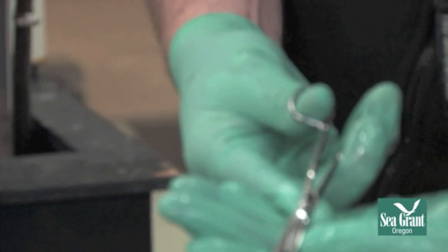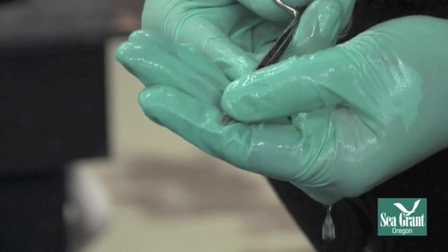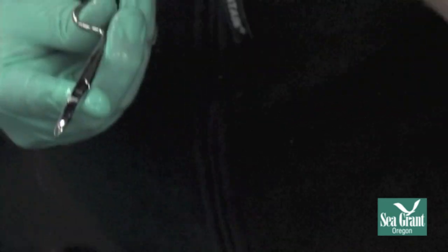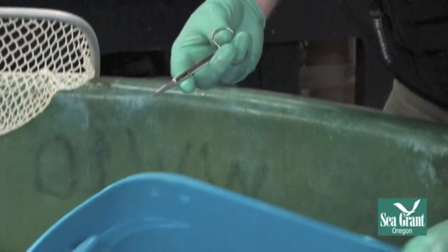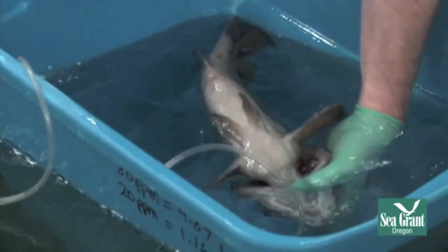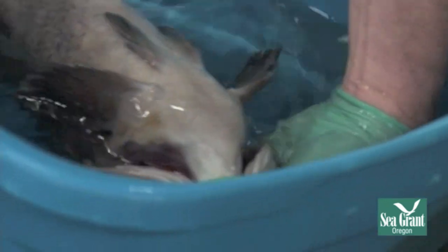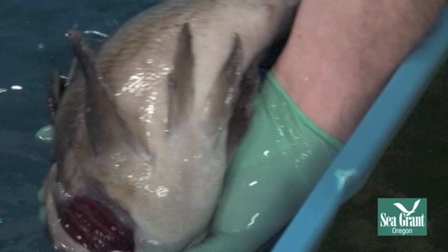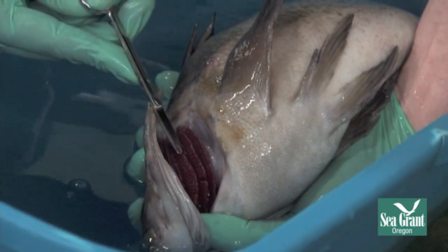What you can see is when we take our biopsy, the scissors form a little cup that holds the piece of gill right there. All we're taking is one to two millimeters. So I come in, get my fish, lift the operculum up, see the piece of gill I want to get, then pull out and do a little snip.